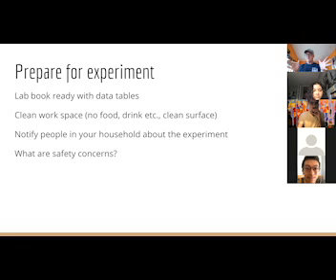You're going to want a clean surface, obviously. You don't want a whole bunch of dust or anything else. I'm going to have dog fur in my experiments, regardless of what I do, but what can I do about that? You don't want to have any food around. You may not want kids coming up and bumping you, or pets bumping you in the arm, if you can avoid that. Are there any safety concerns for today's lab?